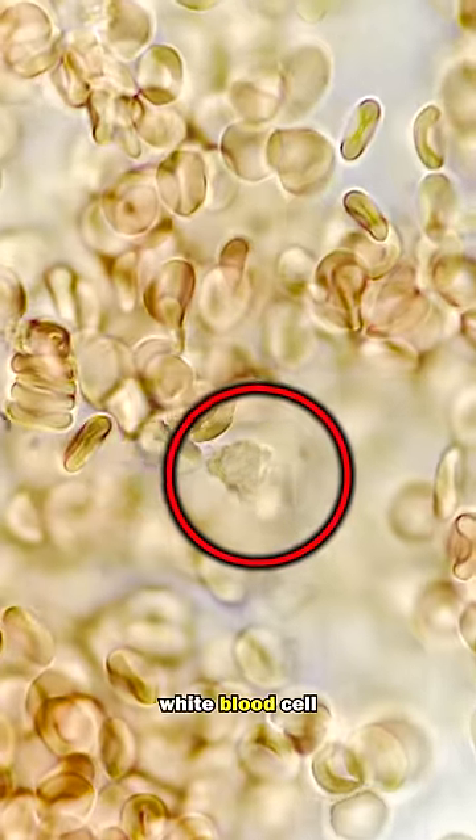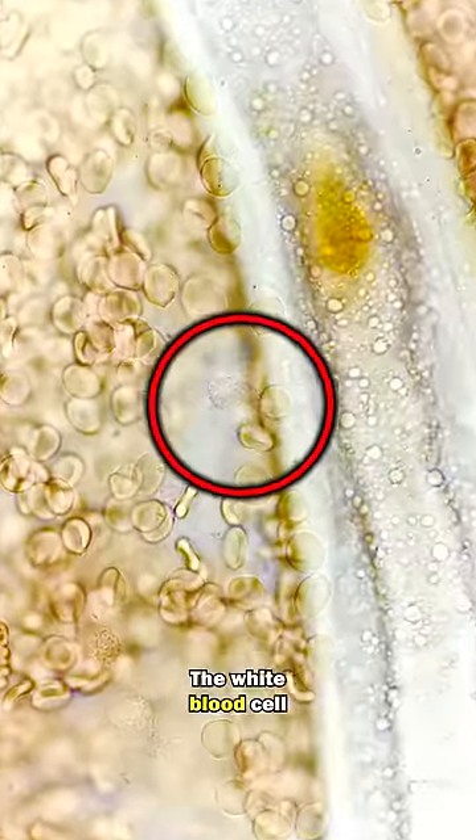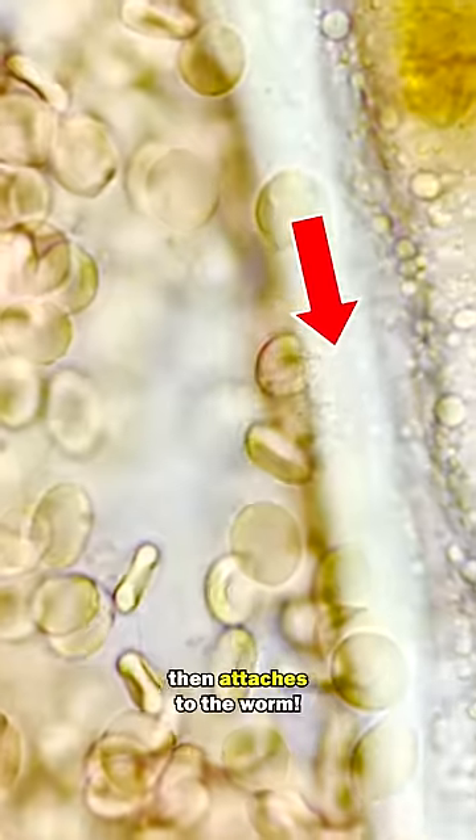Here is another white blood cell finding its way to the surface of the worm. The white blood cell then attaches to the worm.